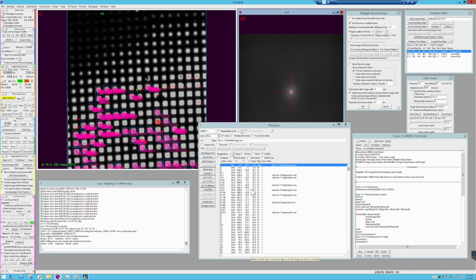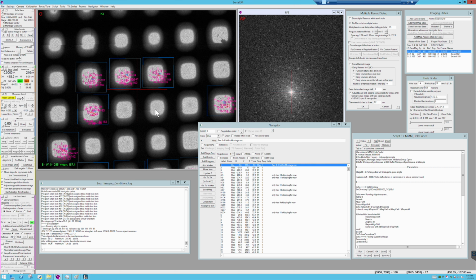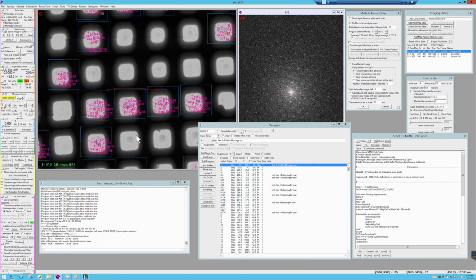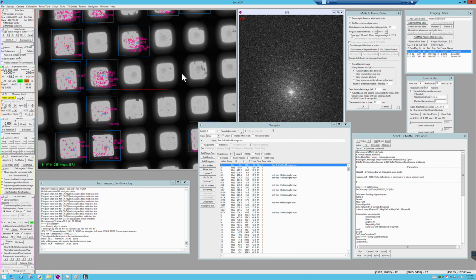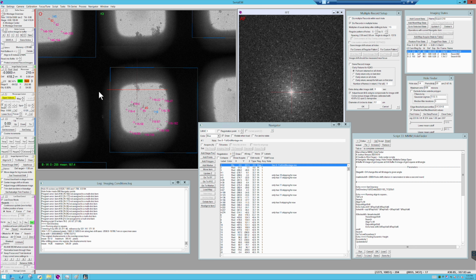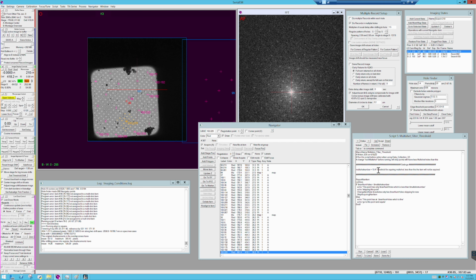Okay, so at this point, I normally inspect the full grid montage, navigator panel, and maps, and the points marked Acquire. If there were any errors or if any of the points were placed over a grid square with thick ice, I will delete them from the navigator. Now run the data collection script as we did earlier in this video.